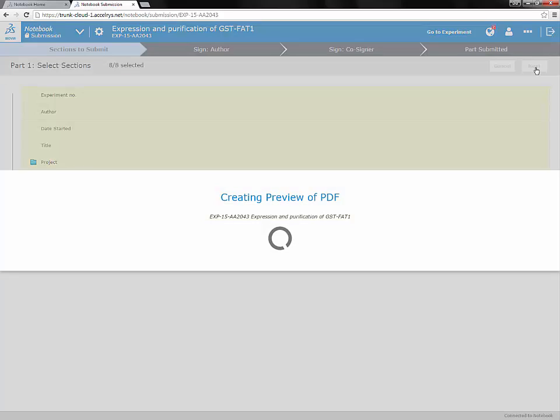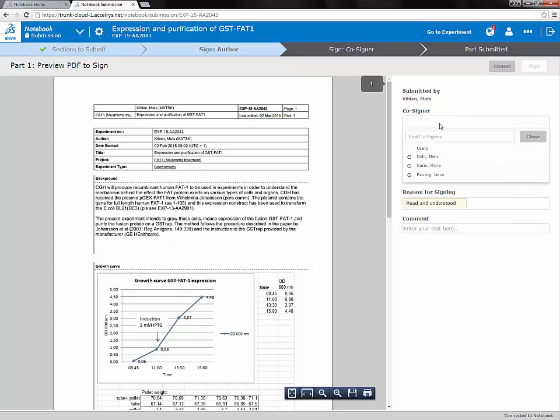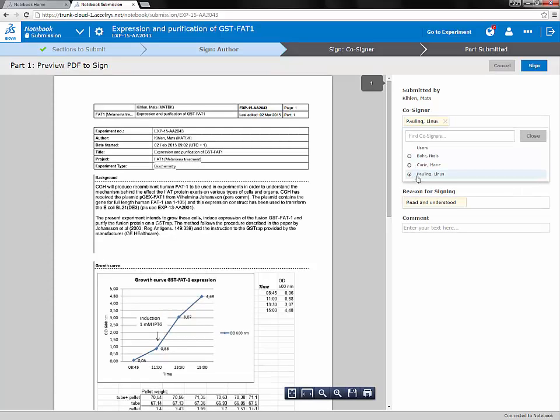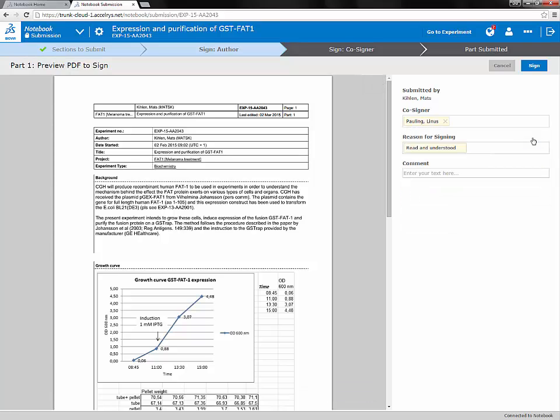Once you are happy with this, you can view the experiment PDF and choose the cosigner and reason for signing. You then add your password to add your electronic signature to the part of the experiment.